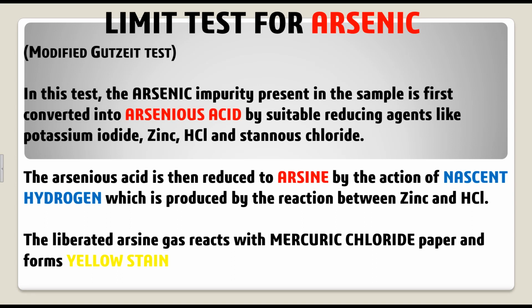Next is limit test for arsenic. Limit test for arsenic used to be called the modified Gutzeit test, because we are using the Gutzeit apparatus here, so that is called the modified Gutzeit test.